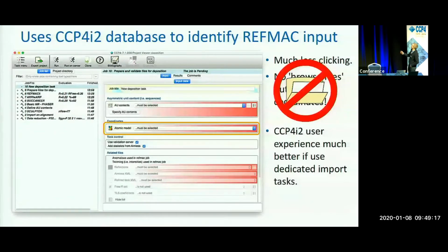Certainly, if you're using this button to browse through the CCP4 directory structure to pick up files called things like xyzout.pdb, you're definitely doing something wrong. We'd appreciate bug reports telling us why you have to do that.